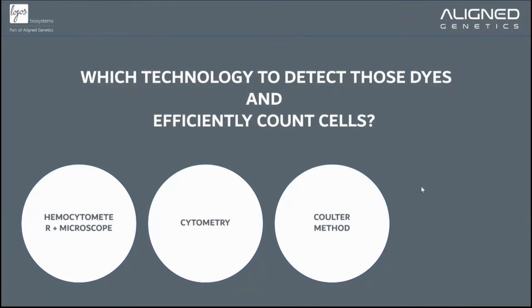When it comes to cell counting, a major pitfall of the technology is the price. You can go up to $4 per count, which is far too expensive. There is also a lack of control. You don't see your images, and it's not efficient when it comes to samples contaminated with debris or contaminants.